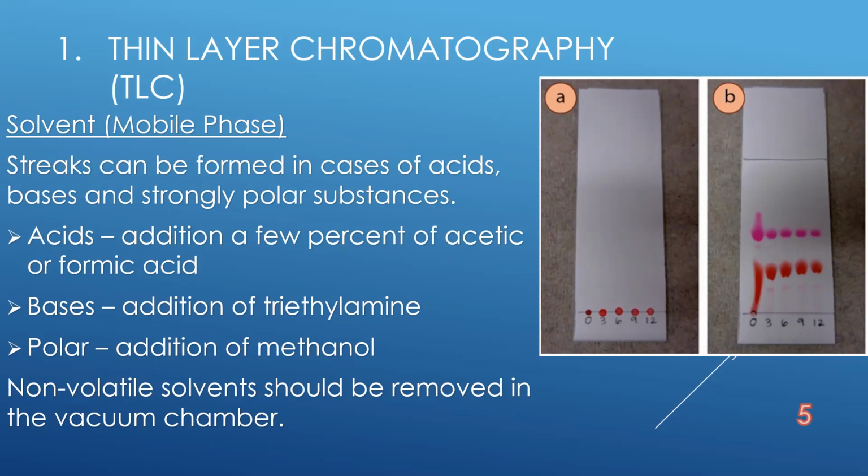So volatile solvent should always be used, and fresh mobile phase should be used each time, because if a mobile phase is used repeatedly, results will not be consistent or reproducible.